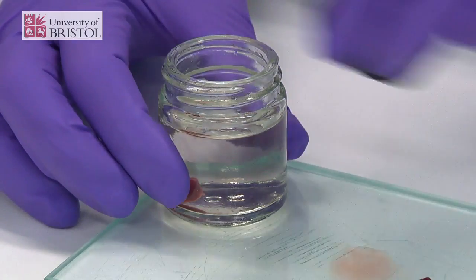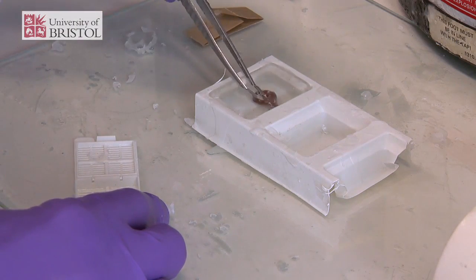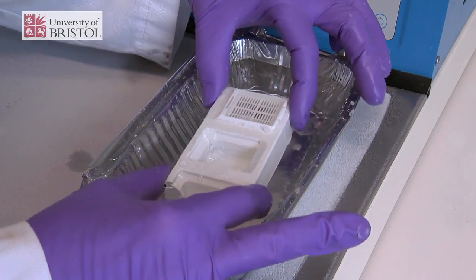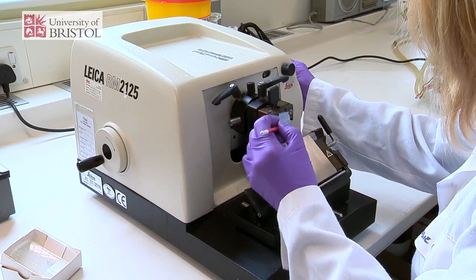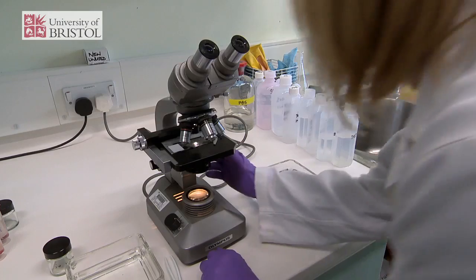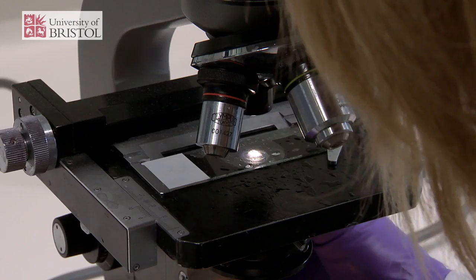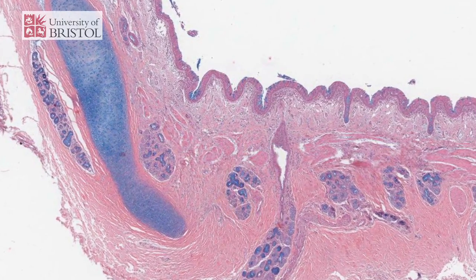In histology, we need to preserve a tissue by fixing it to keep it in as lifelike a state as possible and also to prevent it from degrading. The tissue is processed and embedded in wax, and the wax provides some stability to the section and protects it, which enables us to cut very thin sections of the tissue without damaging the tissue. And we need very thin sections so that we can look at it down the microscope, and it allows light to pass through the section so that it can be viewed.